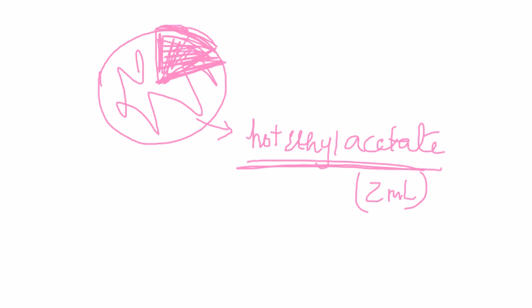Realize that this has to be a continuous heating in order to recrystallize, and you want to make sure that you have a saturated solution.